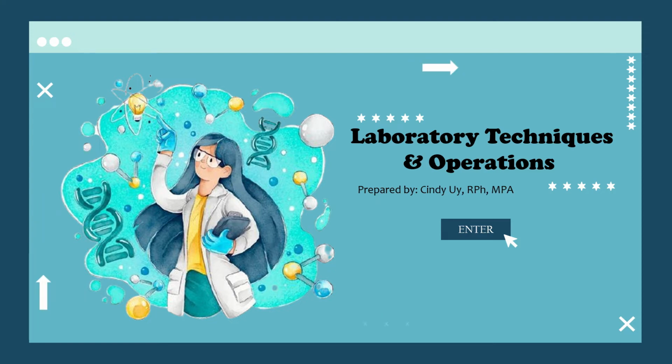But laboratory experiments are sometimes hazardous and may lead to harm if not done right. That is why proper laboratory techniques must be observed at all times. Laboratory techniques are the set of procedures used in natural sciences such as chemistry, biology, and physics to conduct an experiment. All of them follow the scientific method.